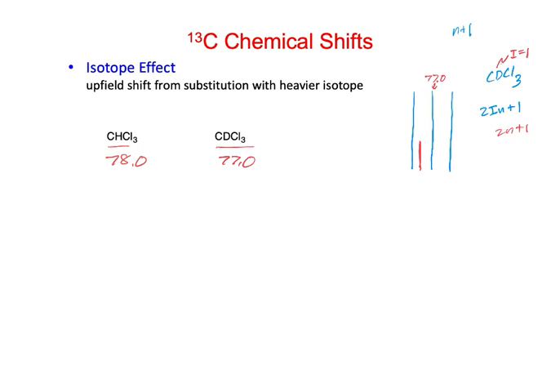Okay, so this would be for the CHCl3, and these are for CDCl3. Okay, so the deuterated one is shifted to a slightly upfield position. All right, so other places you can use this.